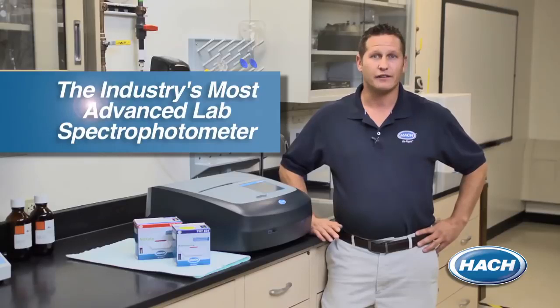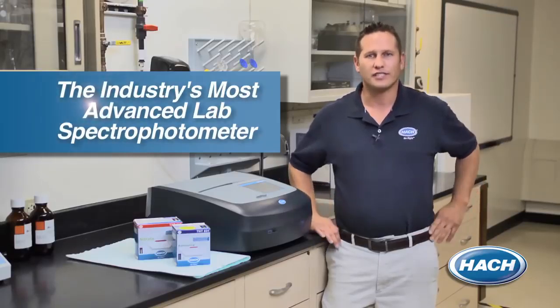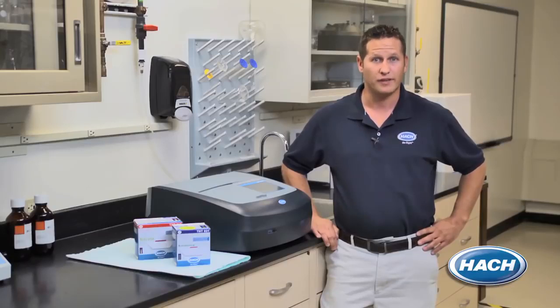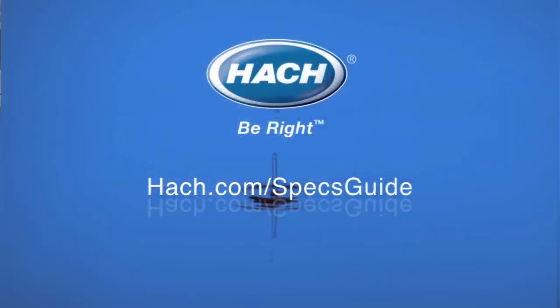Hach has been the innovator in water quality testing for over 60 years and the leader when it comes to service and support. When using our DR6000 spectrophotometer, you can be sure that you are ready to handle your comprehensive water testing needs. Thank you for spending some time with us today and seeing why we consider our DR6000 the industry's most advanced lab spectrophotometer. For more information on the DR6000 and to learn more on some of our other spectrophotometer products, visit us at Hach.com/SpecsGuide.